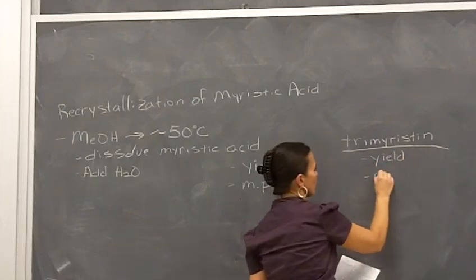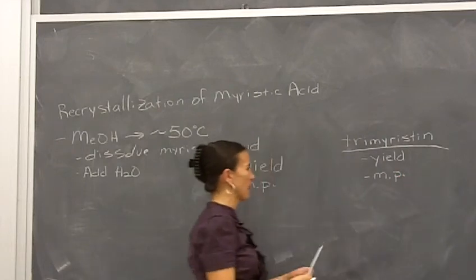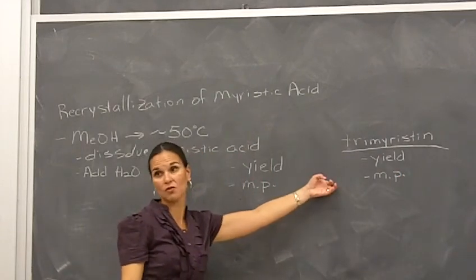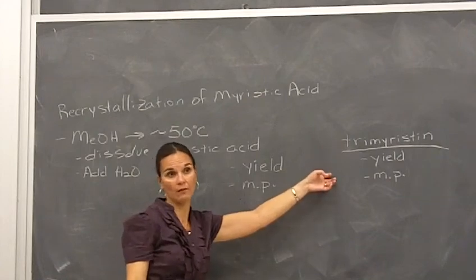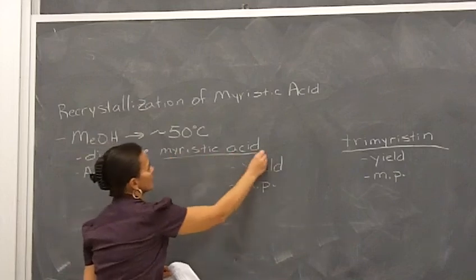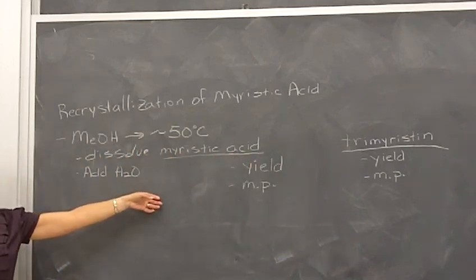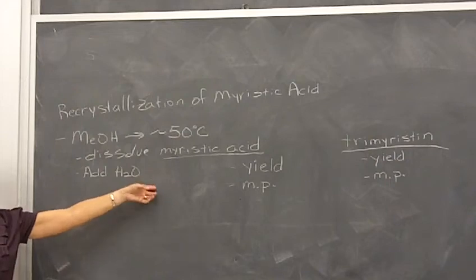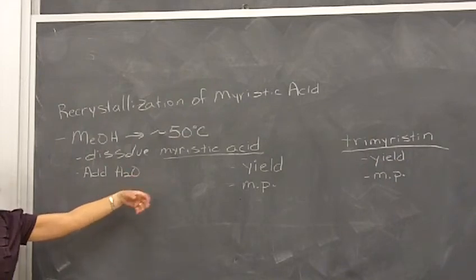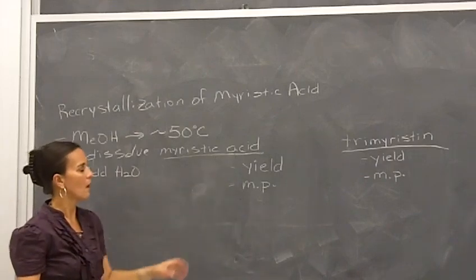And at some point, we should get our melting point as well, okay? And so if you have time in lab this week, you may be able to get it because your trimyristin is already dry, okay? The melting point for your myristic acid, you're going to need to remember to get it after the solvent has dried off, okay? So you've got this methanol water mixture that's going to need to dry, okay?